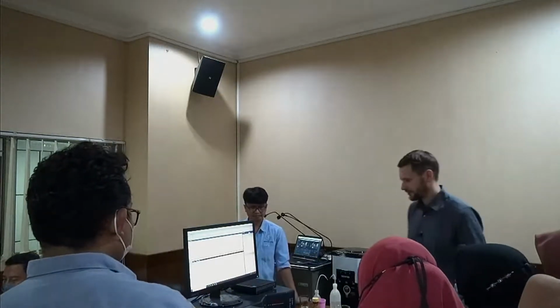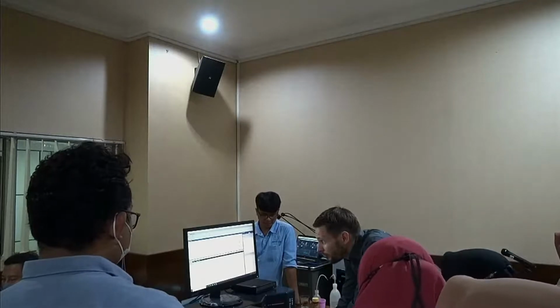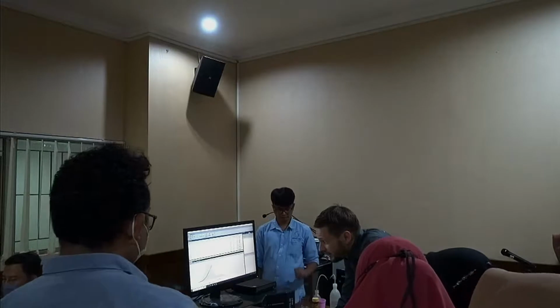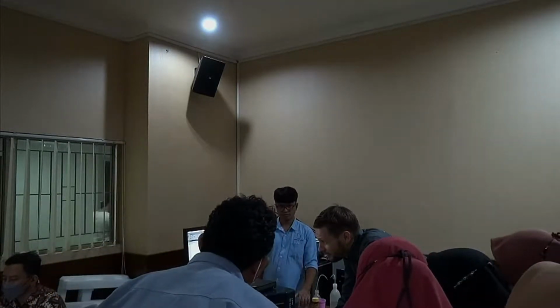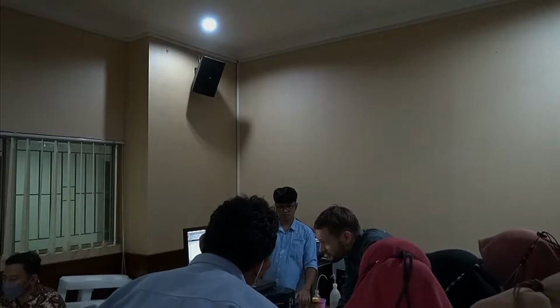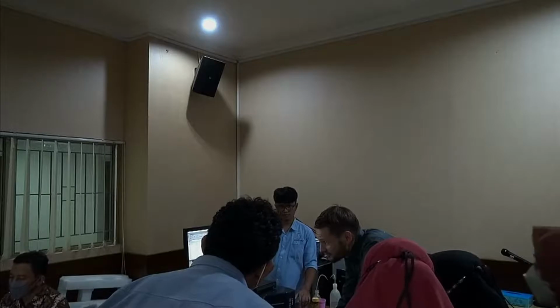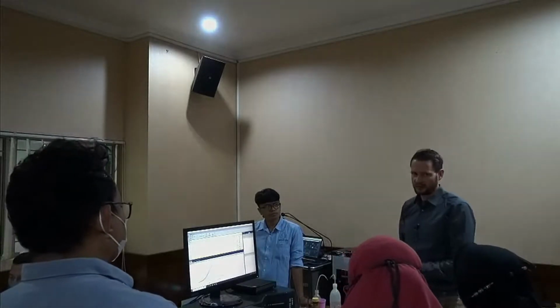Let's have a look. So we definitely see a change. You see first set of measurements, second set of measurements. Surprisingly, this peak shifts a little bit more to the fine range, while the big peak actually did not really exist without ultrasonic, very, very slightly. With ultrasonic, it gets bigger. So first hint, the ultrasonic seems to have a contradictive effect. It's not really making it smaller, it seems to make it bigger.